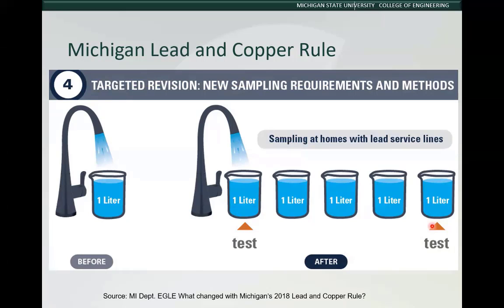It'd be interesting for you to think about this in terms of the analysis that you just did looking at premise plumbing. How representative do you think this 5th liter sample is of what is actually in the service line?